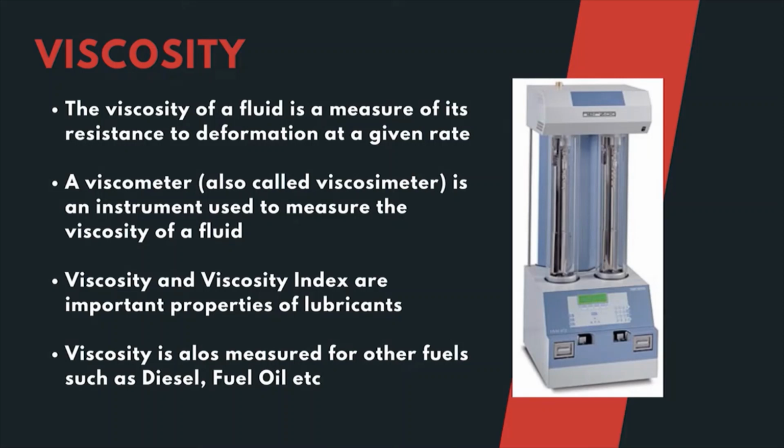Viscosity and viscosity index are important properties of lubricants. Viscosity is also measured for other fuels such as diesel, fuel oil, etc.